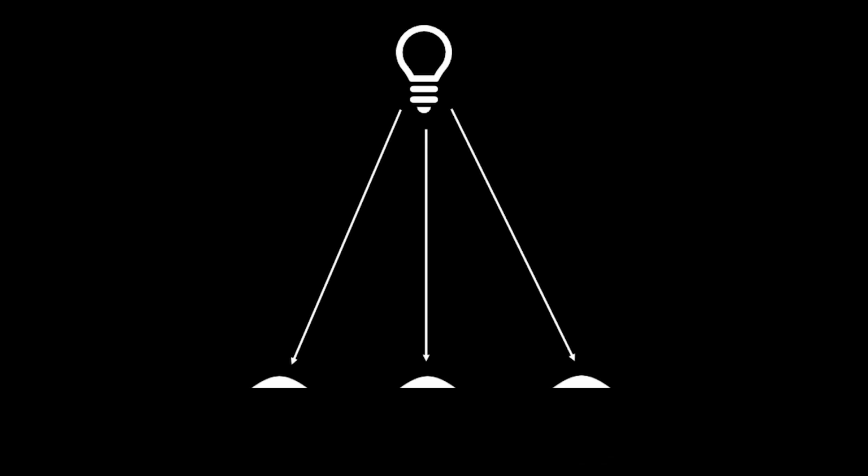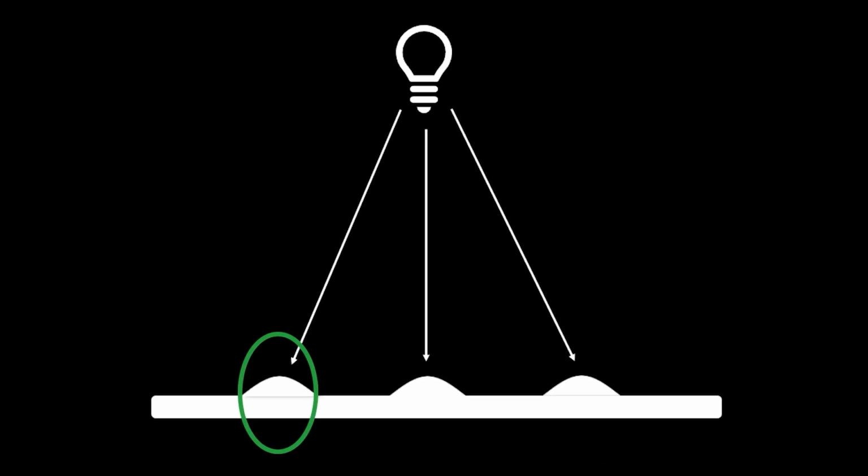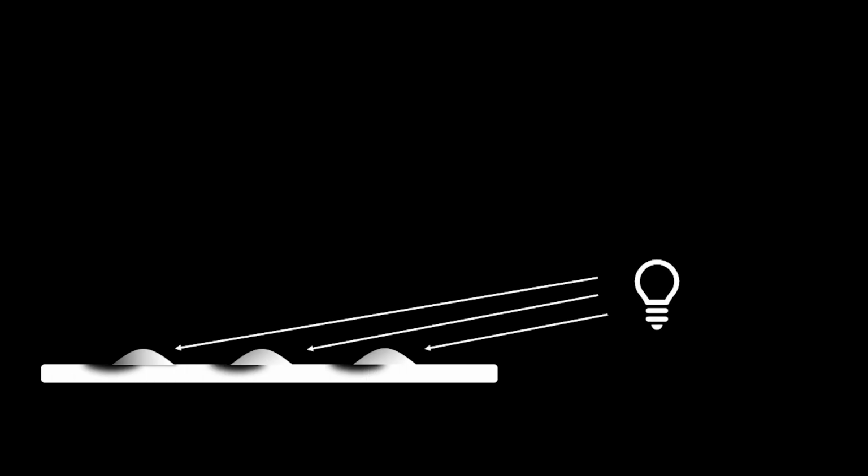If we illuminate from above, if our evidence is 3D in nature, often what can happen is that we actually drown out and minimize a lot of that detail. Whereas if we bring our light low to the surface and light along that surface, anything that's 3D in nature is going to start generating areas of light and shadow, and that is going to show much more detail in that surface.